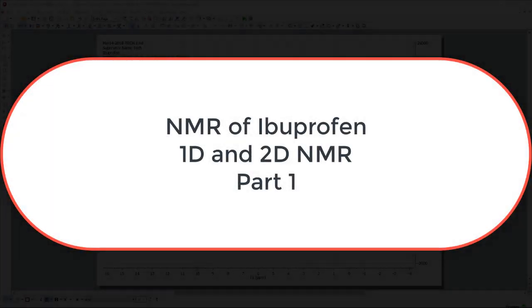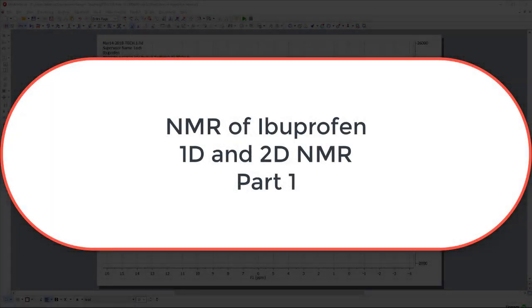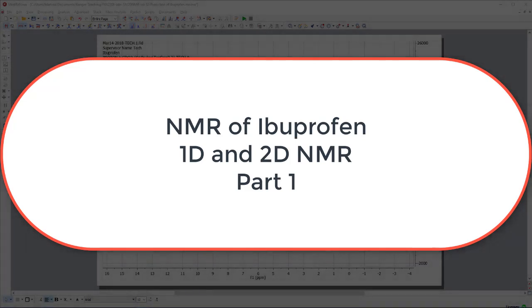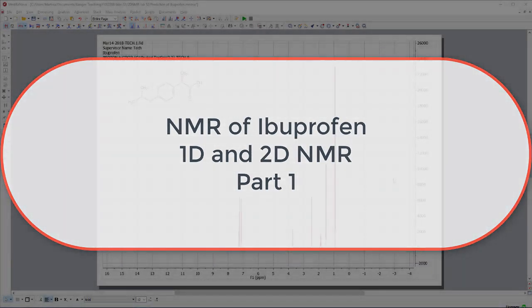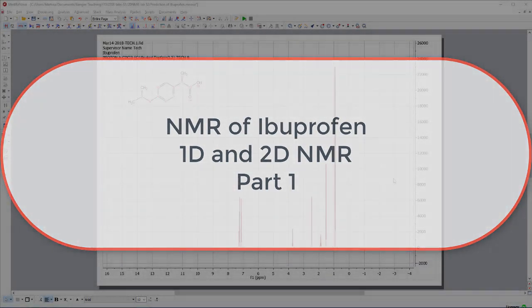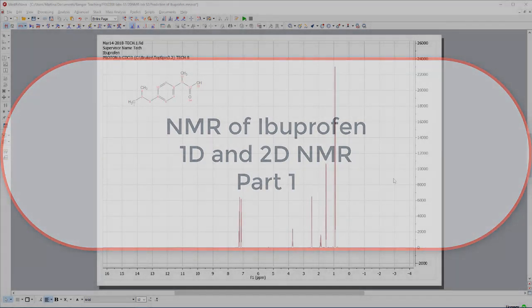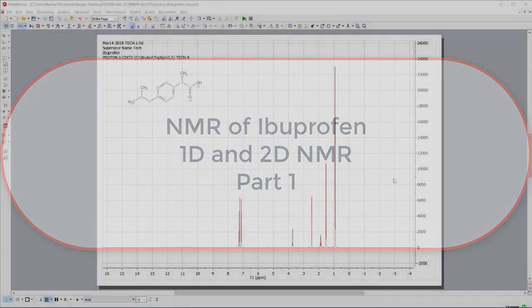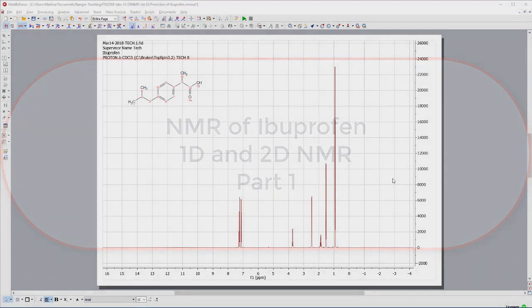Hi. In the following sequence of videos, I'd like to recap some one-dimensional NMR spectroscopy and introduce you to how to process and use two-dimensional NMR spectroscopy.